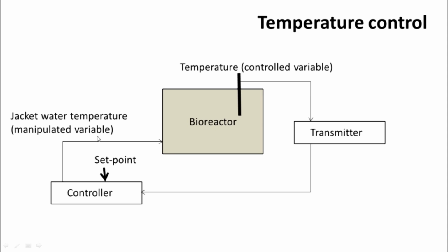This is a straightforward temperature control. This is fundamental or basic control that one looks into if somebody is interested in control of systems. And this is a classic way of representing the controlled variable and manipulated variable, which are terms that are used in the control literature.